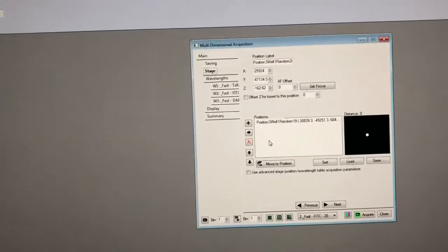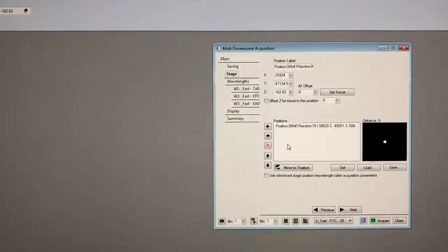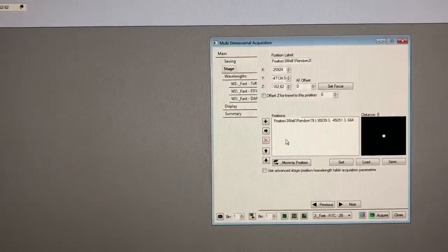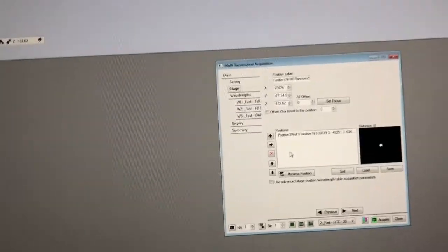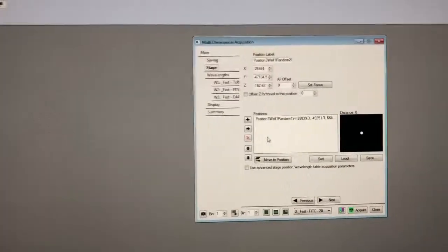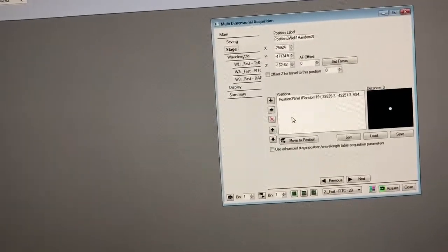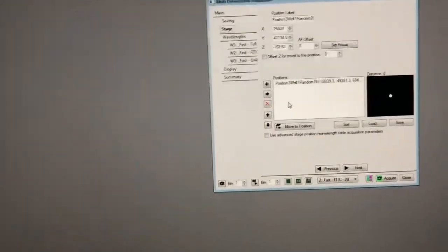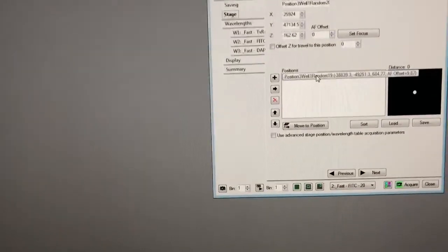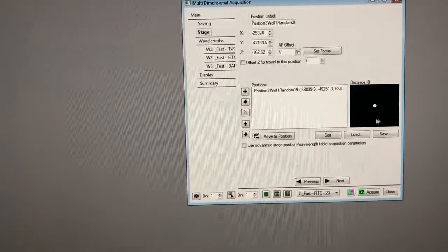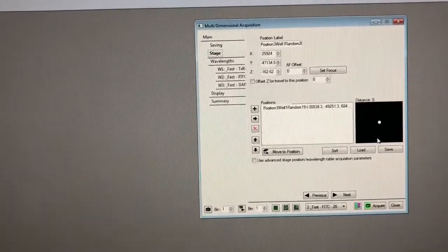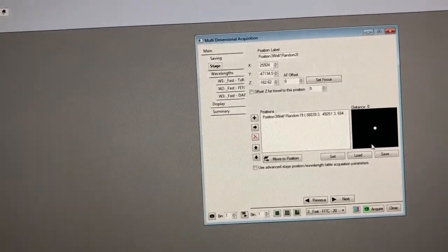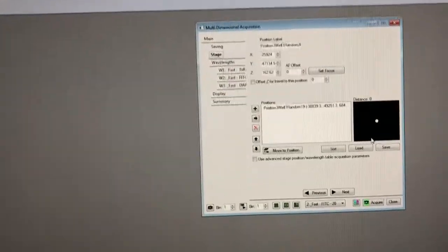Okay, so typically what I do is I use the stage to navigate to the center of the sample which is roughly where we are now. I focus, I mark the position which I'll show you how to do in a second, and then from that position I tell the software okay sample randomly from this center point.